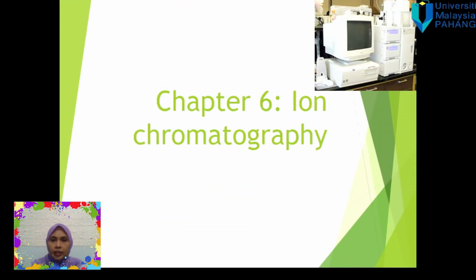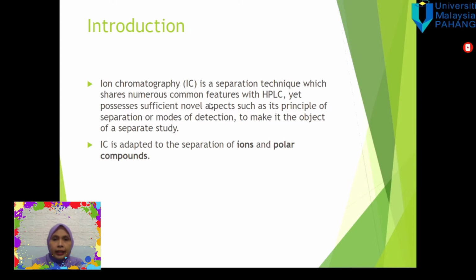Assalamualaikum. We continue this session with the topic of ion chromatography. If we look at this picture, the instrument of ion chromatography is quite similar to the HPLC, but they have some differences in the aspect of the principle of separation or mode of detection. So it can be taught separately from the HPLC.